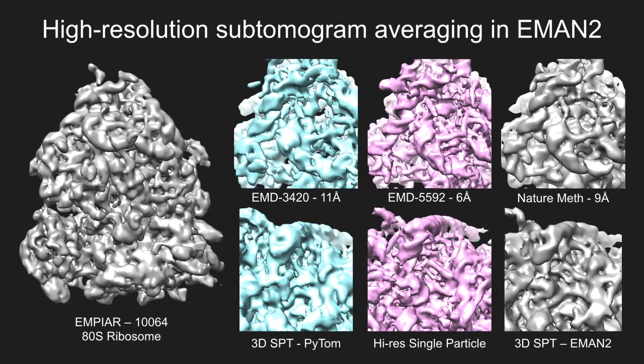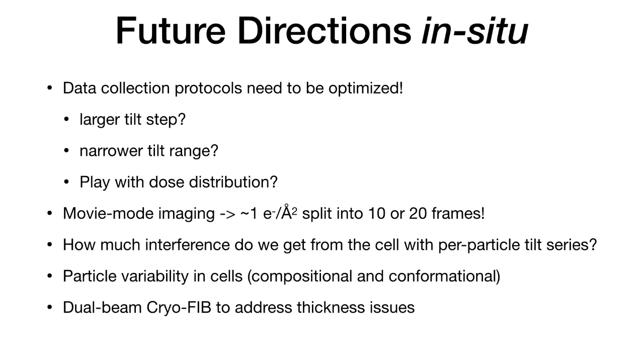So doing all these corrections can have a positive impact, but if the data wasn't collected with high resolution in mind, that's often still going to be a limiting factor. So that's pretty much the end of what I wanted to tell you about today.